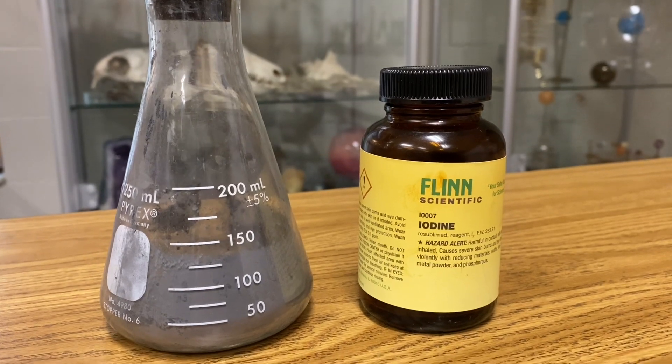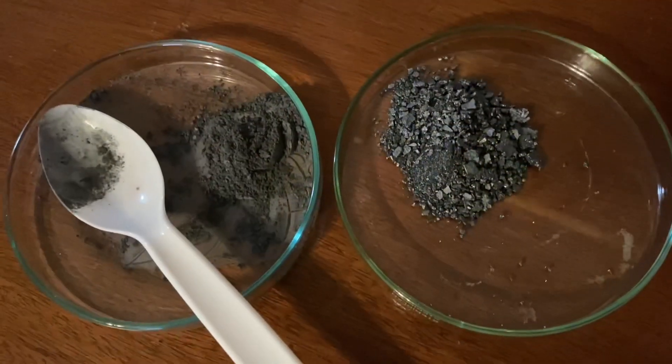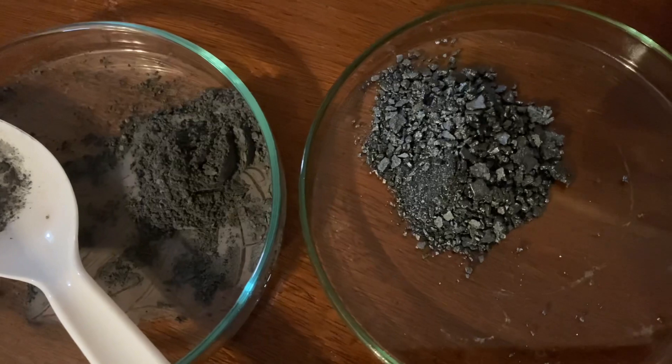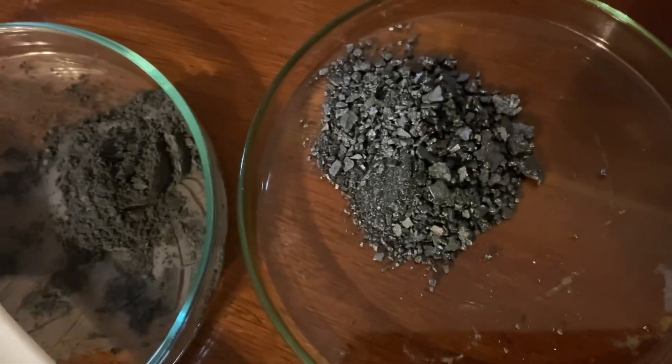All you need for this reaction is some iodine and some aluminum powder. Start out by measuring a one to two ratio with two parts iodine, one part aluminum. So here I have about three grams of powdered aluminum and about six grams of iodine.